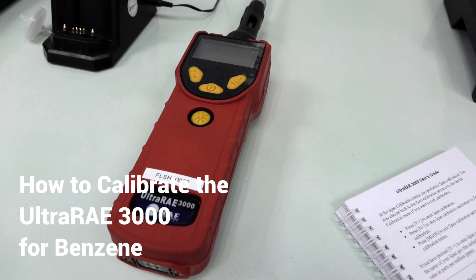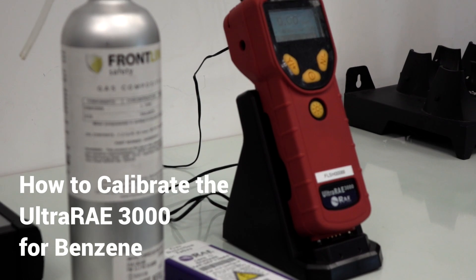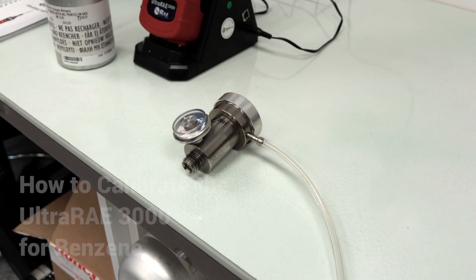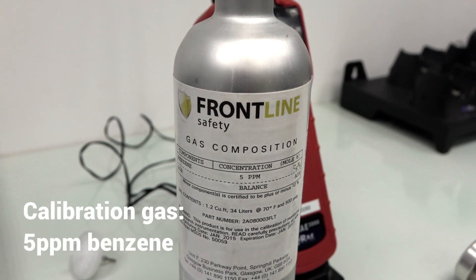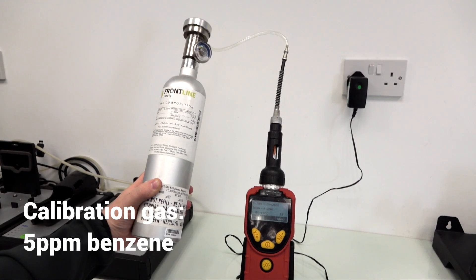In this video we're going to show you how to calibrate the Ultra Ray 3000 for benzene monitoring. To perform the calibration you need the following pieces of equipment: a demand flow regulator, a benzene separation tube, calibration gas with a concentration of 5 ppm benzene and balance of air.